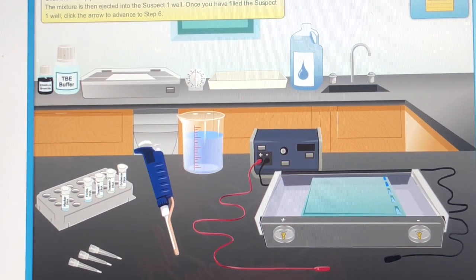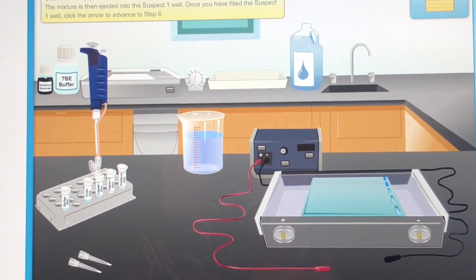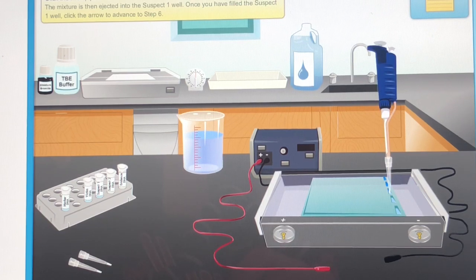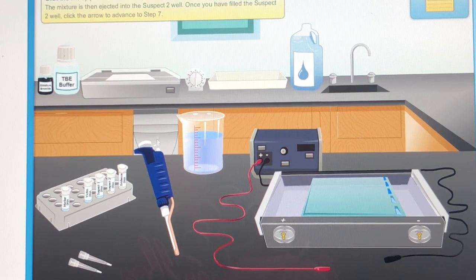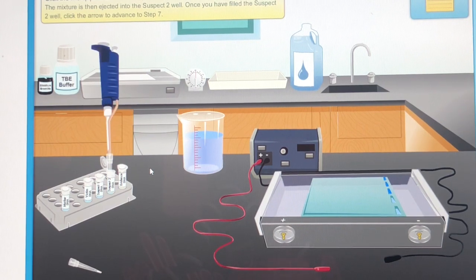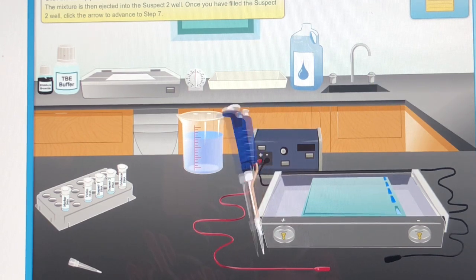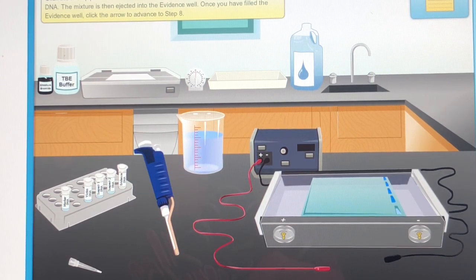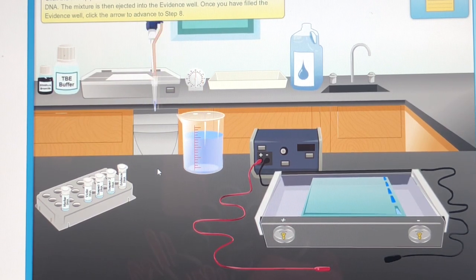Click the micropipet to load bromophenol blue dye and mix it with Suspect 1's DNA. The mixture is then ejected into the suspect 1 well. Once you have filled the suspect 1 well, click the micropipet to load bromophenol blue dye and mix it with Suspect 2's DNA. The mixture is then ejected into the suspect 2 well. Once you have filled the suspect 2 well, click the micropipet to load bromophenol blue dye and mix it with the evidence DNA. The mixture is then ejected into the evidence well.